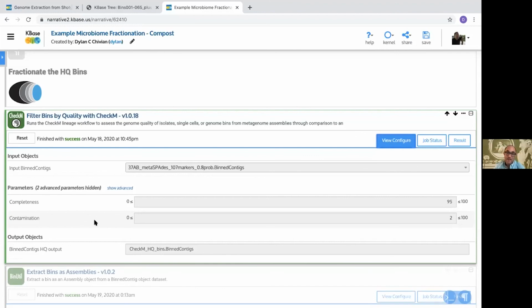And so the definition of a clade-specific single copy marker, because it's dependent upon that, may be an incomplete picture. And so doing hard thresholds like 0% contamination is not to be trusted.